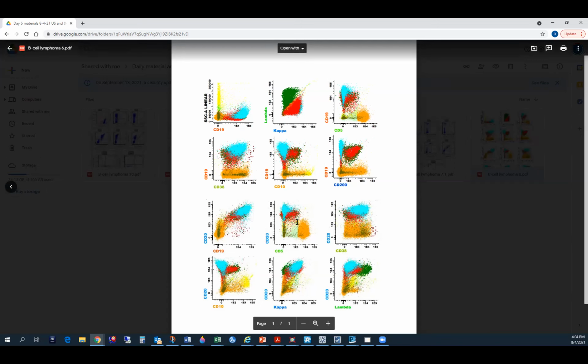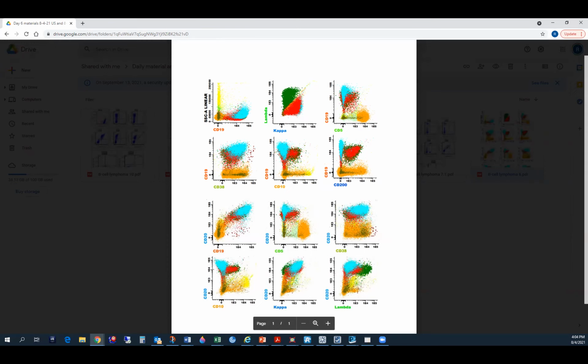Okay. So I agree, it is restricted, and the reason that you're not clearly seeing it is because the FITC here, the kappa was with FITC. Usually it is with FITC. It was not very bright in our lab there. And actually, you see the red population of normal B cells with kappa, and it is matching in the intensity. In fact, it is even a little bit brighter than the normal background kappa B cells. So that's what helps.